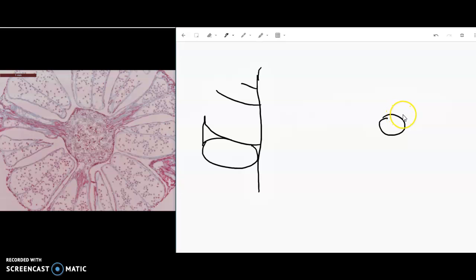sporophyll, sometimes you're just seeing the sporangia, but the thing I want to emphasize here is that there are two sporangia on each sporophyll. So we kind of see two bag-like structures on each one.